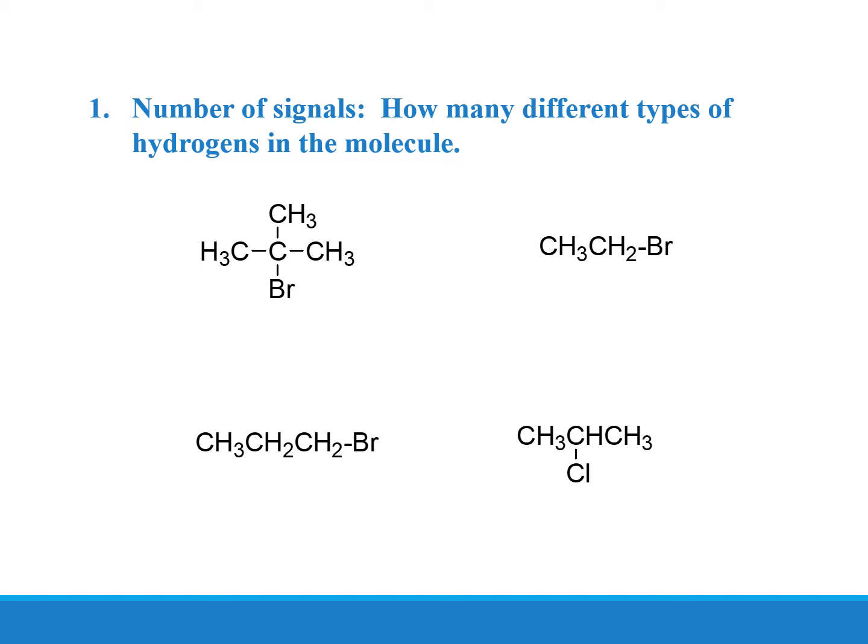What do you think? How many peaks do you think we will have for propyl bromide? How about for 2-chloropropane? Take your time and try to give your quick guess for this one, and you will have the answer later on in the coming slides.